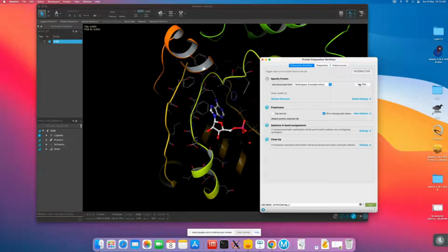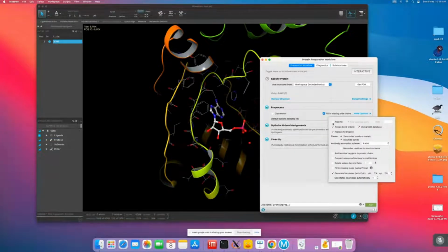So we have taken Get PDB from here. We can pre-process it. It will take 5 to 10 minutes. So you just click on this and you can either align it according to Chimera as well, align to any first selected entries, or you just click PDB ID. You can give any other PDB ID and select on it, so it will align to that particular PDB ID. We have already done that in Chimera, so I won't be repeating it.